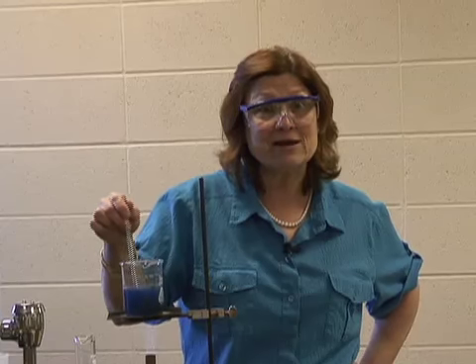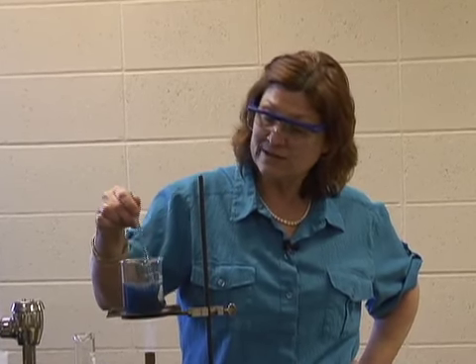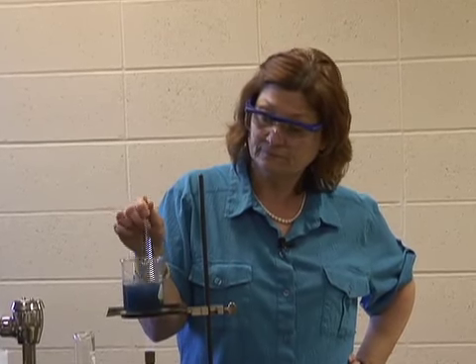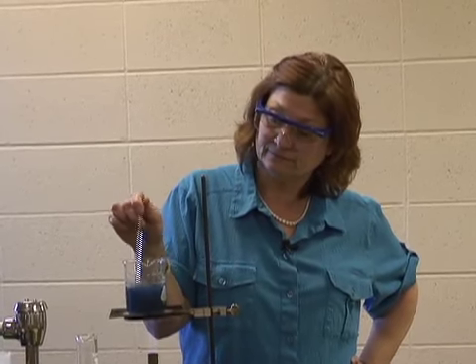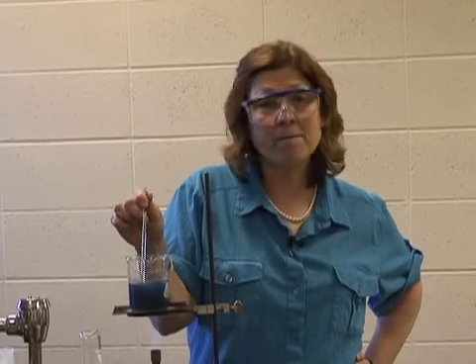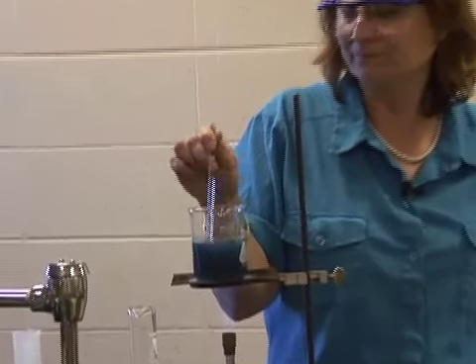We're going to be graded on how much of the copper we get back out. So we need to keep this stirring rod here and not place it on the lab station, because it has copper on it. We don't want to lose any of that copper.